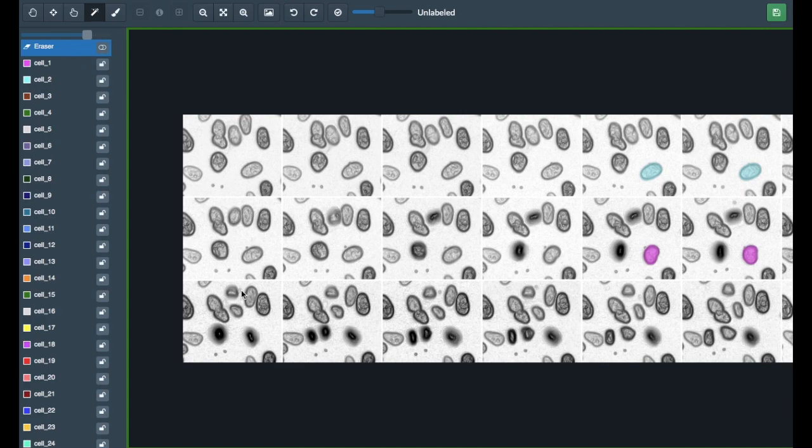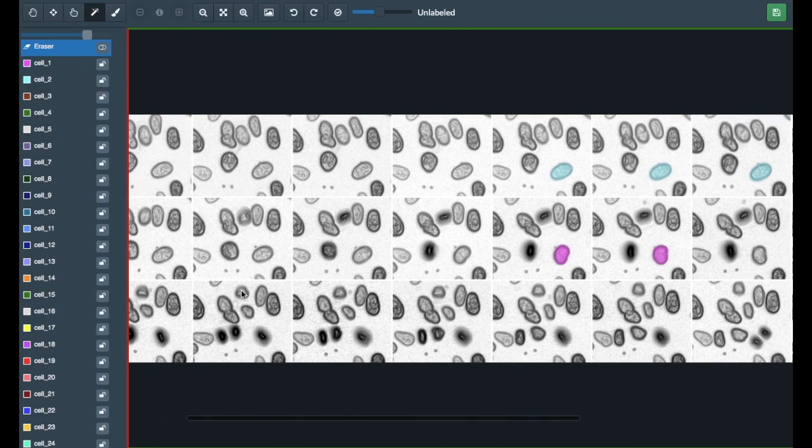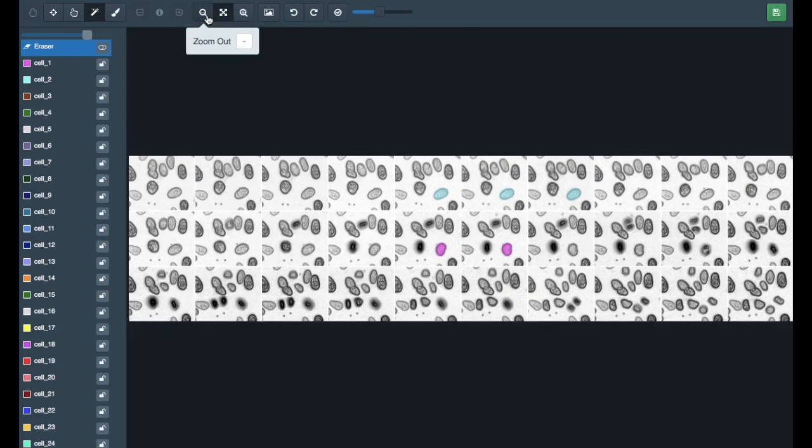and should be ignored. After you have accurately colored all cells in an image, you're ready to submit. Good luck, and thank you for helping us with our project.